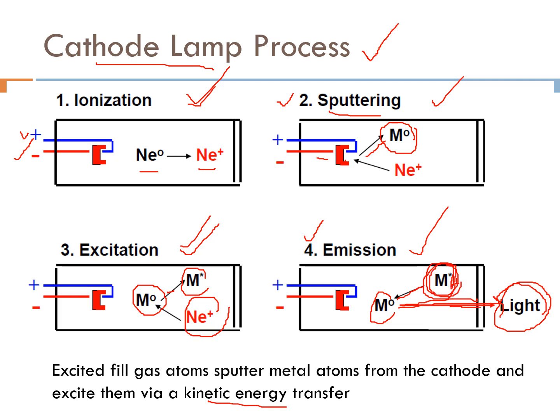Okay, then this emitted radiation from the source akan go to the flame. And dalam flame ni ada sodium metal juga, which is our metal of interest, dan sodium metal inside the flame akan absorb this radiation.